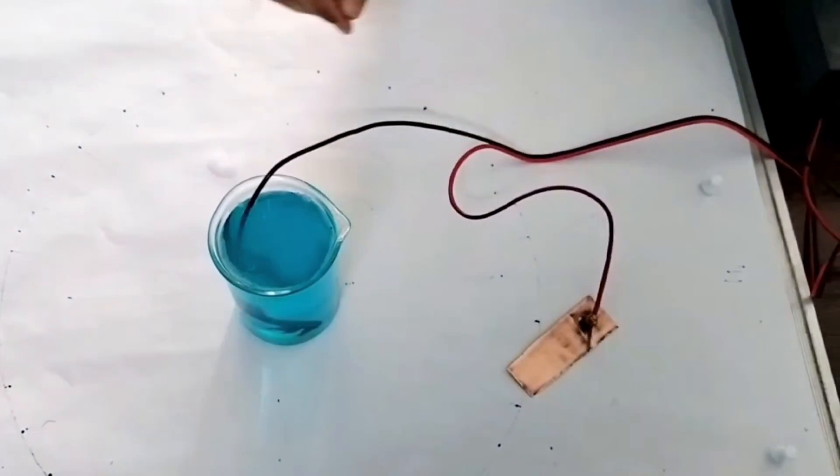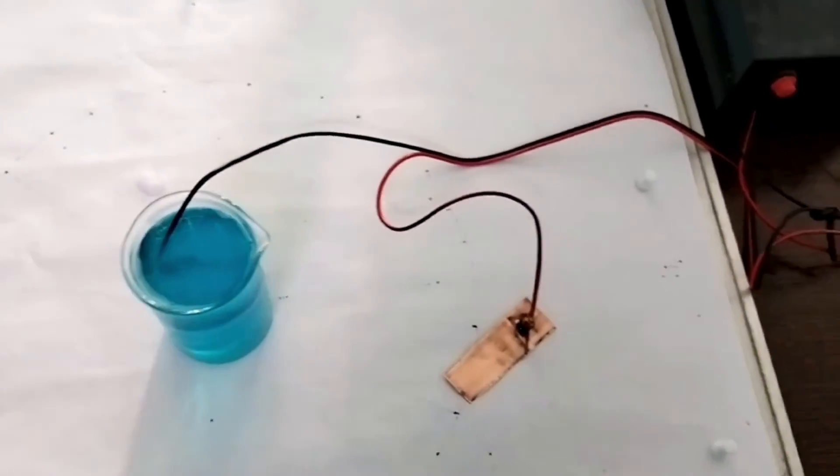Suspend the tied iron key into the copper sulphate solution.